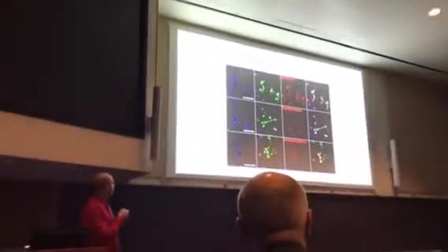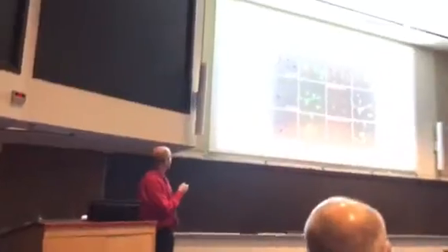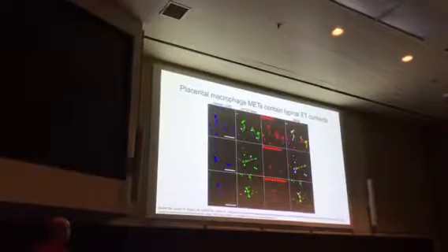And so what we've stained for, in blue, is Hoechst, which is a condensed chromatin stain, normally used to stain nucleus, but in areas where the extracellular traps are thicker, you'll also see some staining. That's Sytox Green, that DNA intercalating dye, and then specific antibodies for these different proteins.